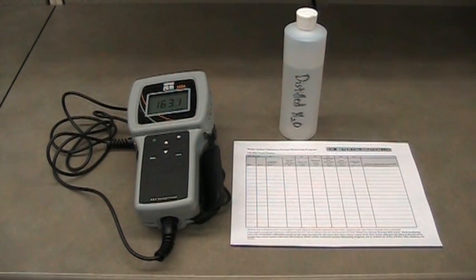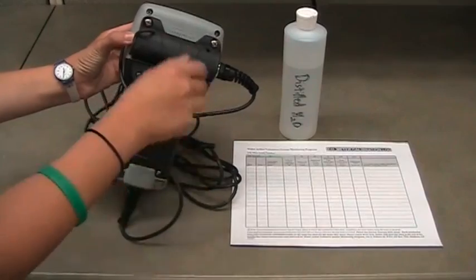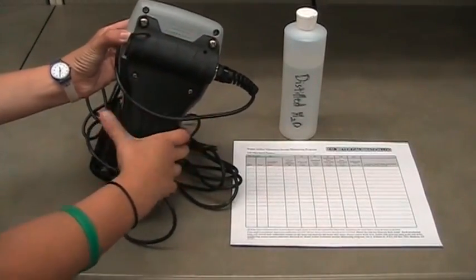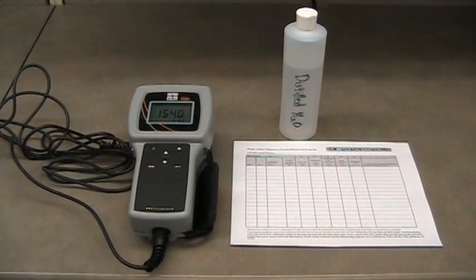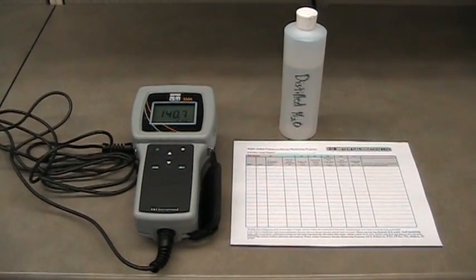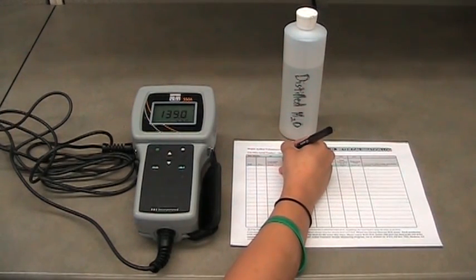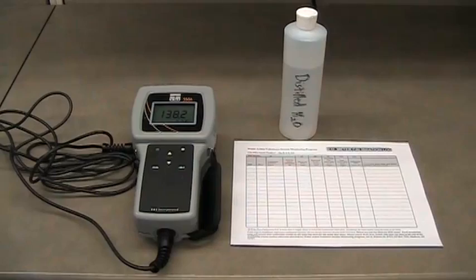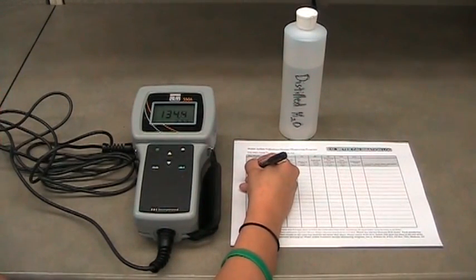If needed, complete the top section of your dissolved oxygen calibration log. The serial number is located on the back of the meter. Always keep the calibration log with the meter. If volunteers are sharing a meter, they should share the calibration log. Give the calibration log to your local coordinator or WAV staff when the sheet is full. Make sure to pass on the log any time you pass on the meter to others for use or maintenance.